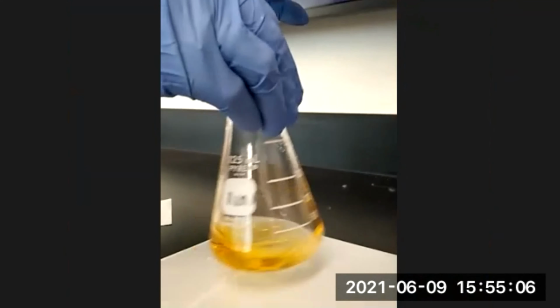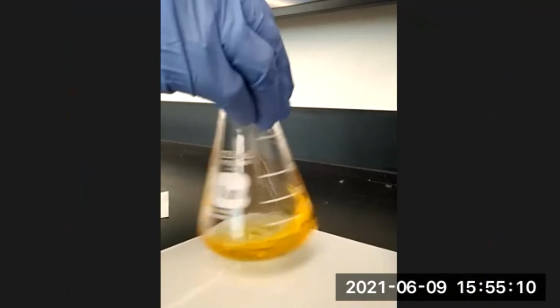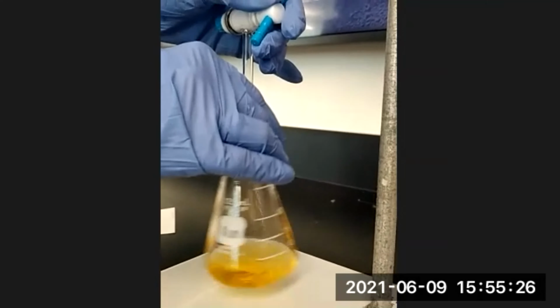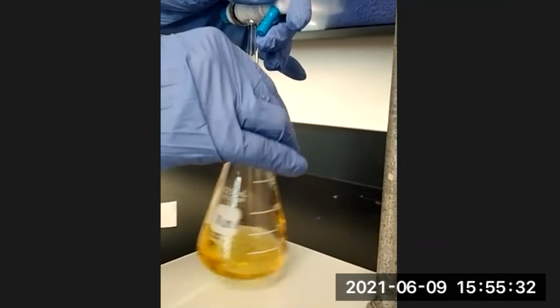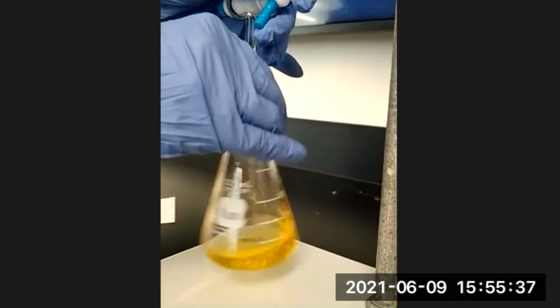So keep on adding HCl until it changes color. Notice how one hand grasps the stopcock, the other one has the Erlenmeyer. So you're gently adding the hydrochloric acid to the Erlenmeyer flask.